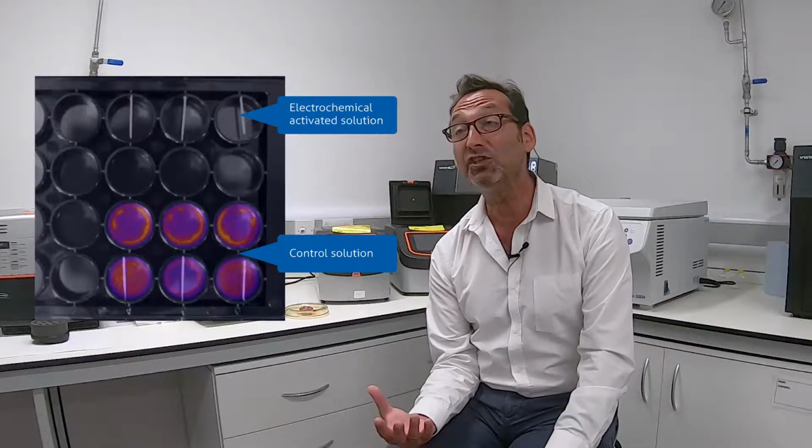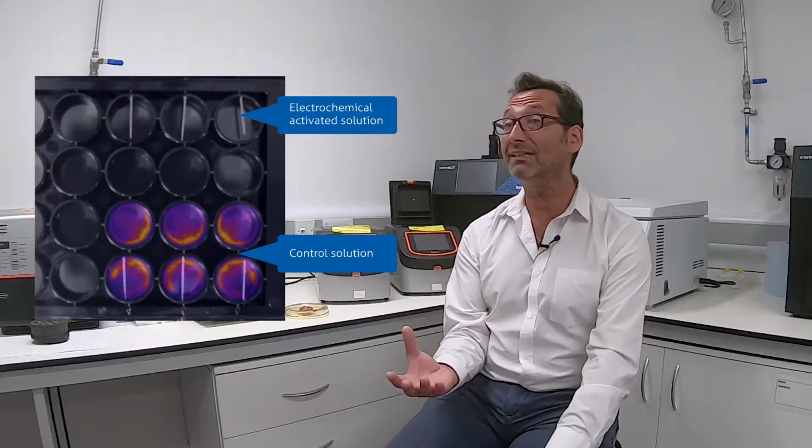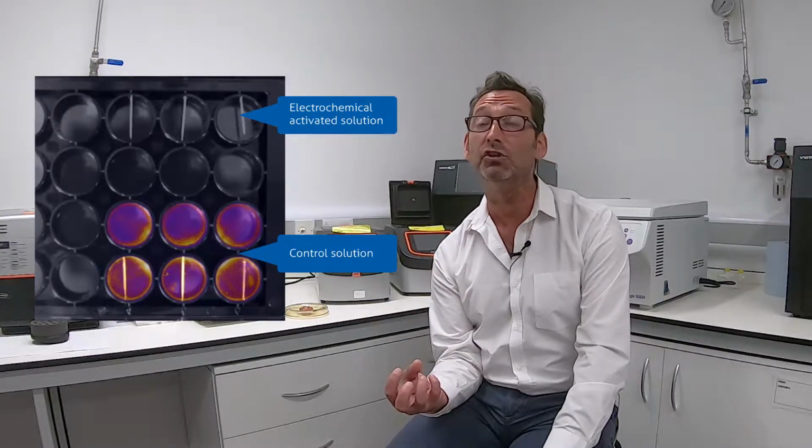Well, that means that we can come back the following day and see if the bacteria that we think we've disinfected has grown back. And in some of the work we've done, it's pretty apparent that many disinfectants do not have a residual quality about them or do not kill enough bacteria in the initial application, and that results in regrowth. What we've discovered with using ECAs is that that regrowth is very, very minimal.